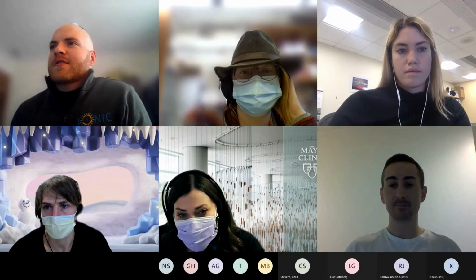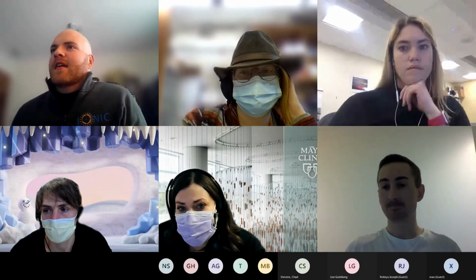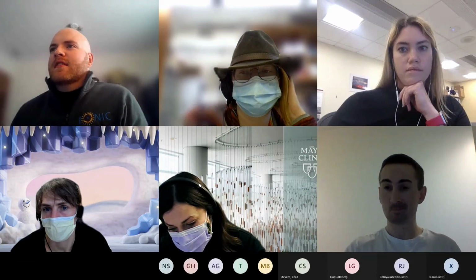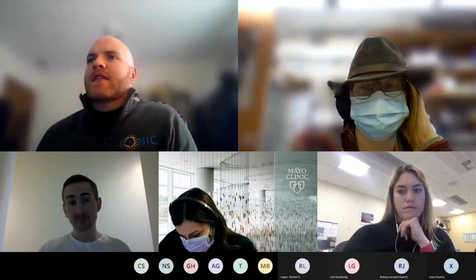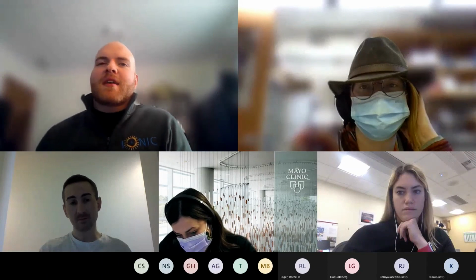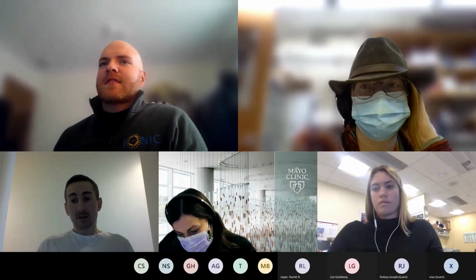We have another question in the chat from Greg. Are there any proteins expressed intracellularly on the platelets, and are they of interest to interrogate, or is intracellular staining even possible with platelets?